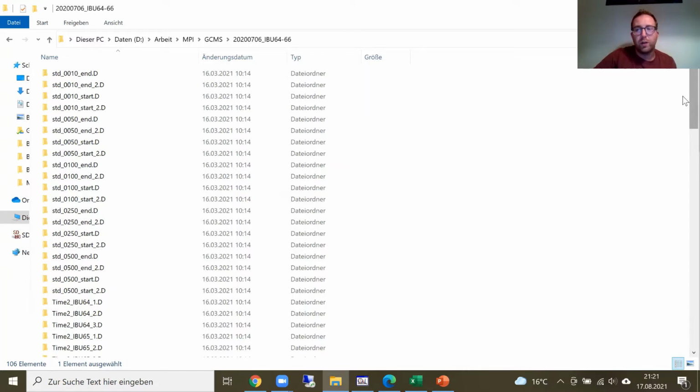Usually we're working with E. coli, and in this particular example, I just want to show you we engineered E. coli to produce the biofuel isobutanol from glucose. And here I just want to show you an example where we want to compare two different strains we generated regarding their performance of isobutanol production. So if they have a higher titer or yield and productivity.